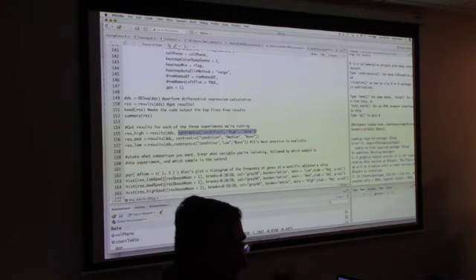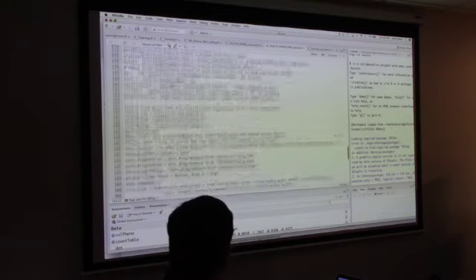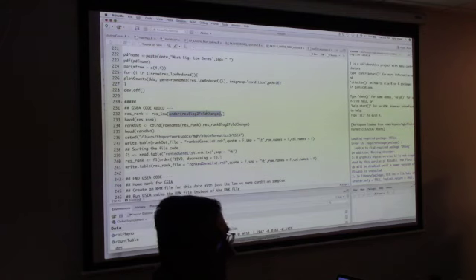That's important, okay? So once you do that, and you have your results, either you take the results or your results high, any of these. So basically, I'm assuming res or results here represents one of these, whichever is your condition you're interested in. Okay. So when you take that, then you rank or order everything by the fold change in your result, right?